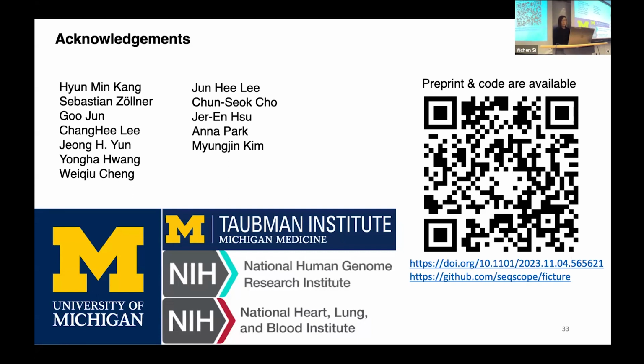Other downstream analyses we have considered include, for example, the cell-type-specific spatial expression pattern. But most of the cell-level downstream analysis after cell segmentation is based on cell type: the first thing is to determine cell type and then do downstream analysis. So you can condition on the pixel-level factor the same way as you condition on the cell-level cell type assignment.